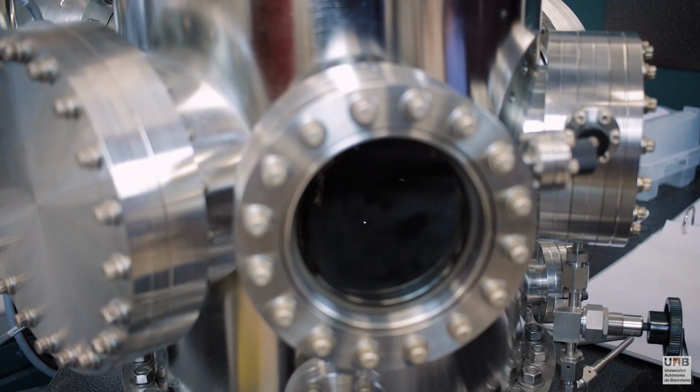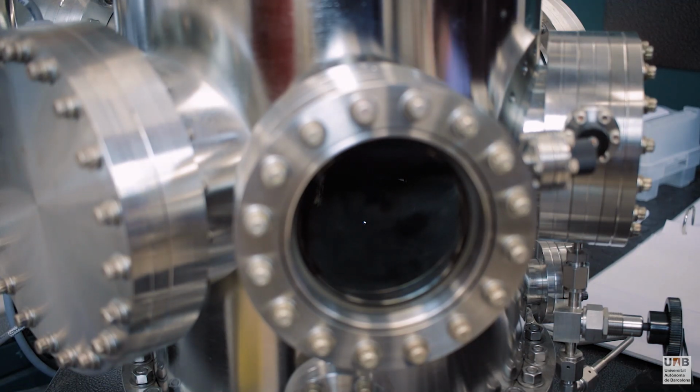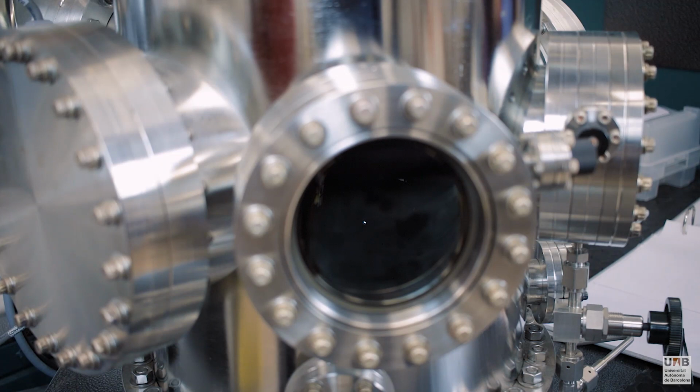Okay, so now I've set everything up to sputter inside the chamber. I've got the power supplied to the gun, I've got argon flowing in the chamber, I've got the pressure set to 3 millitorr, and now I'm going to sputter. So I'm going to go ahead and open the shutter.